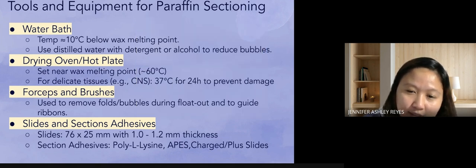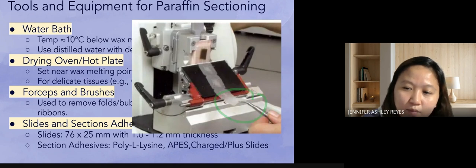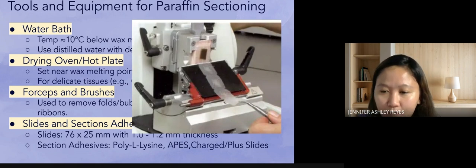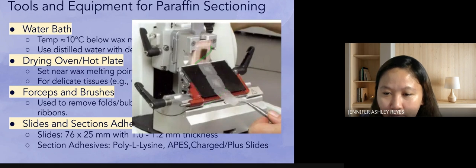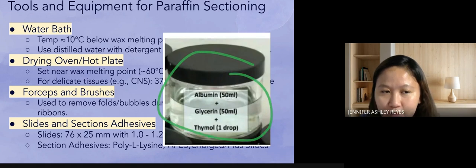Okay. Next, of course, forceps and brushes to remove the folds or guide the sections after microtomy. Okay. So this one, you can use this for preventing microbial growth.